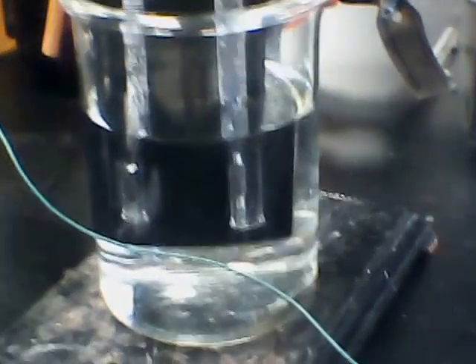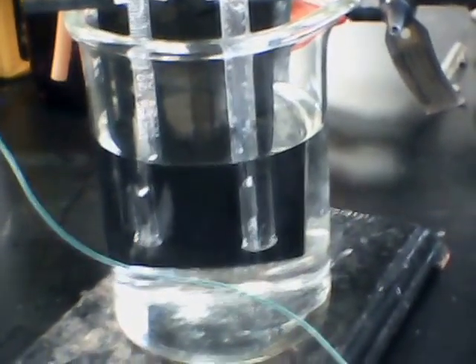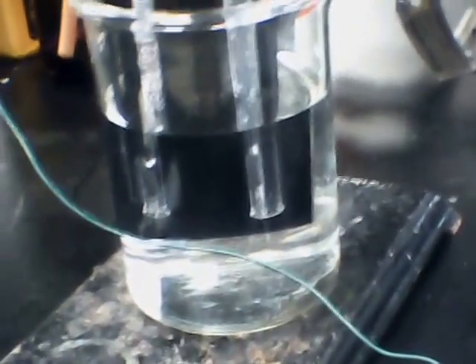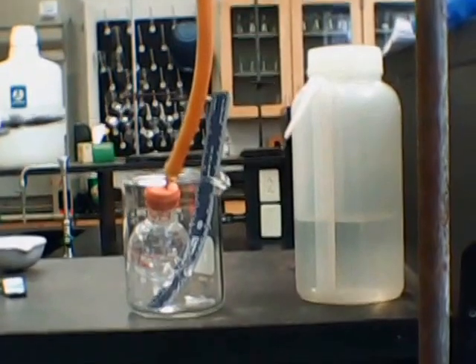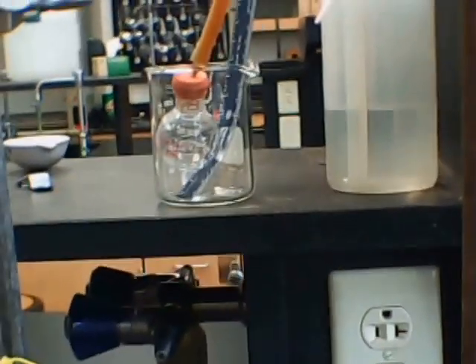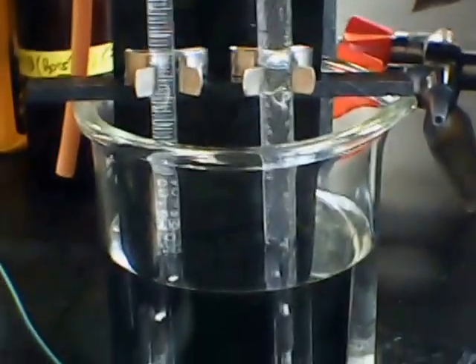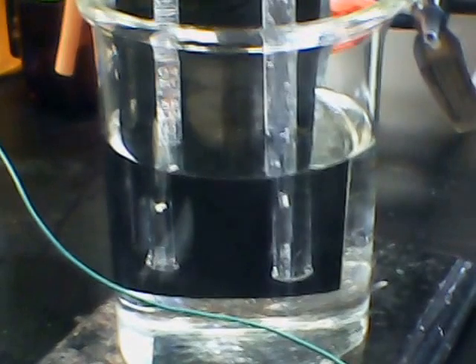As we go along and get this set up, over the next couple of months we'll have updated videos showing the work we're doing — bench-scale hydrogenations. This will be part of an introductory fuels lab course I'll be teaching starting in the spring semester of 2015. Among other things we'll generate and utilize the hydrogen gas. The Brownlee apparatus — small tips of platinum metal serve as electrodes.